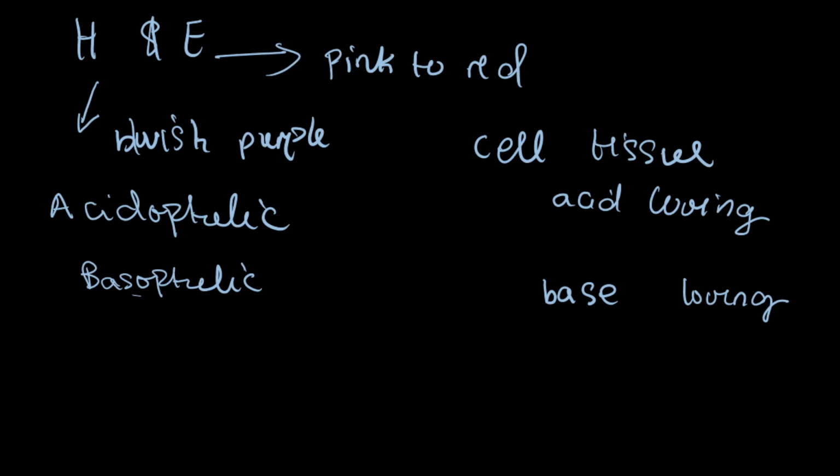Hematoxylin is a basic stain. What does this mean? Being a basic stain means that the color impacting component of hematoxylin is a base or a basic radical.